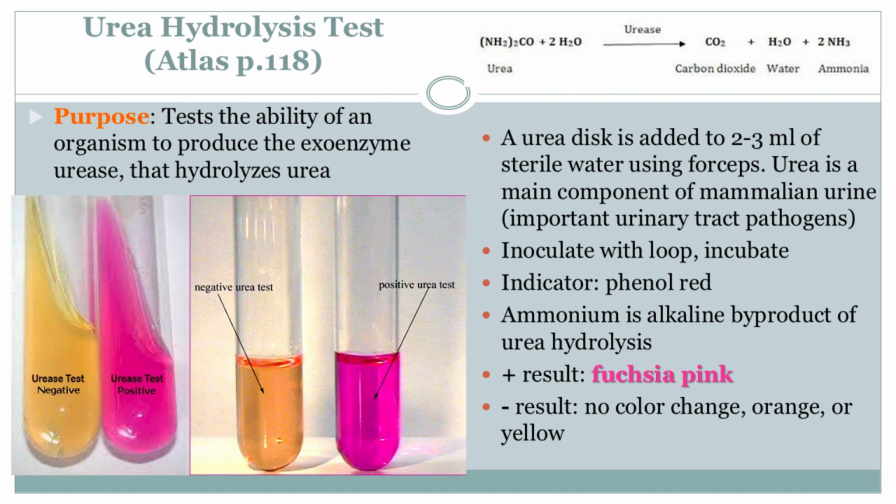Urea Hydrolysis Test. Sounds complicated. The name's a mouthful, but it all comes down to whether a bacteria can produce a specific enzyme. Urease. Okay, hold on. Enzymes, bacteria. You're losing me. Right, so urease. It has this thing for urea. Urea, like what's in pee. Exactly. It's a waste product our bodies get rid of in urine.